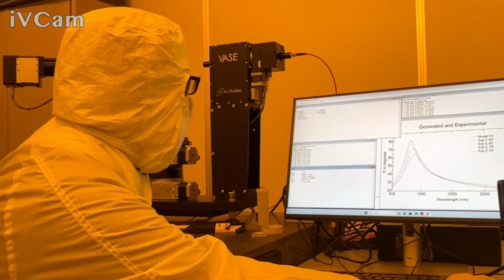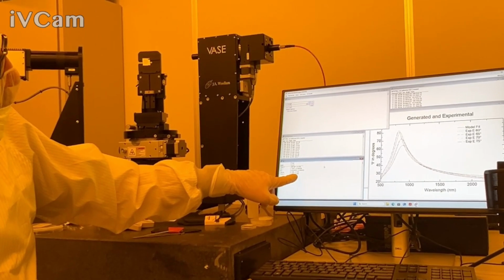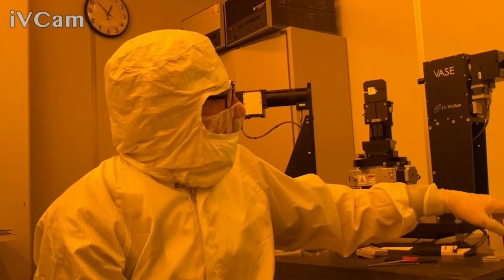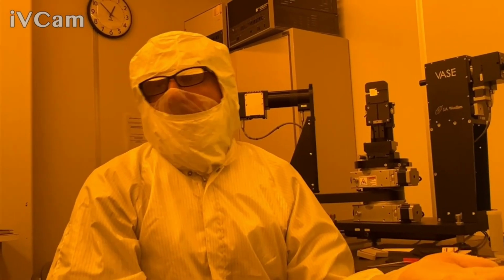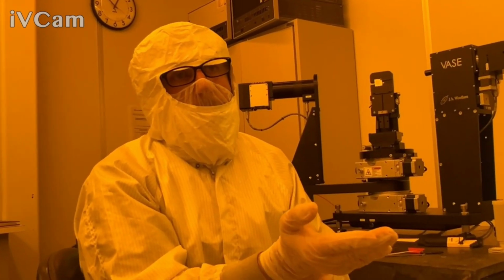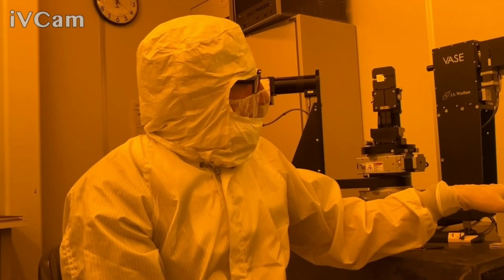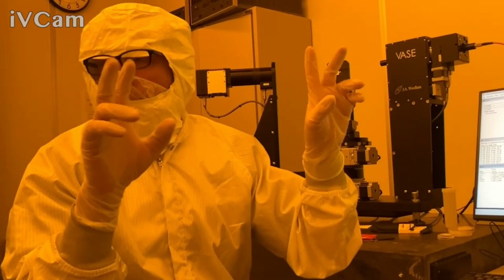So in this case, if I included roughness in this model, there are two things. One is my confidence limit is very poor. This error bar here is the 90% confidence limit in the model of what I'm fitting right now. Obviously you don't want to say, hey, my answer is 1 plus or minus 30. That's bad. In general, we like to see whatever you're fitting have a confidence limit of at least 10% or lower. So if it really thought there was 1.4 nanometers of roughness, I would want to see plus or minus 0.14 or lower to have it be more realistic.